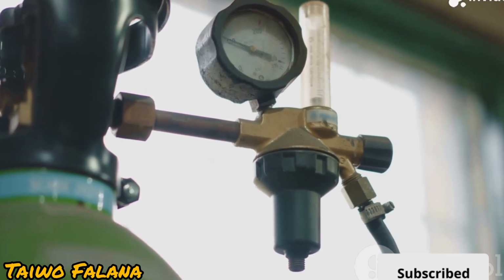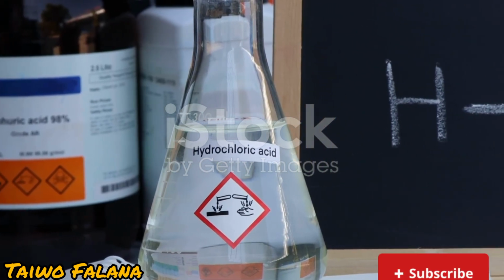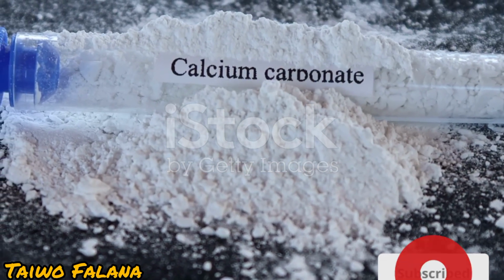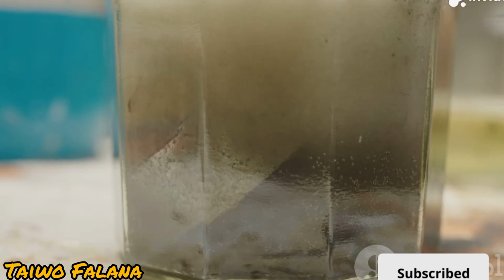Let's start with carbon dioxide, CO₂. In the lab, you'll need dilute hydrochloric acid and some solid calcium carbonate, think chalk or limestone. The acid drips onto the carbonate and you'll see fizzing as CO₂ gas bubbles out.